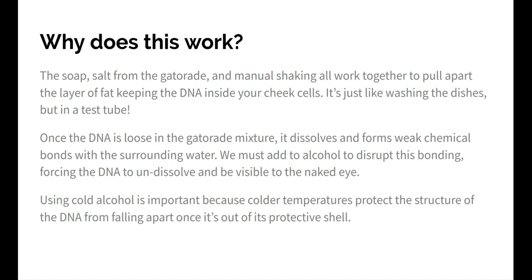Using cold alcohol is important because colder temperatures protect the structure of the DNA from falling apart once it's out of its protective shell. Once you have this extraction completed, you can really only hold it in the tube for about maximum 5 minutes before it starts to dissolve again. But the cold alcohol will just shock it into being structurally strong enough to be picked up and manipulated for a little while at least.